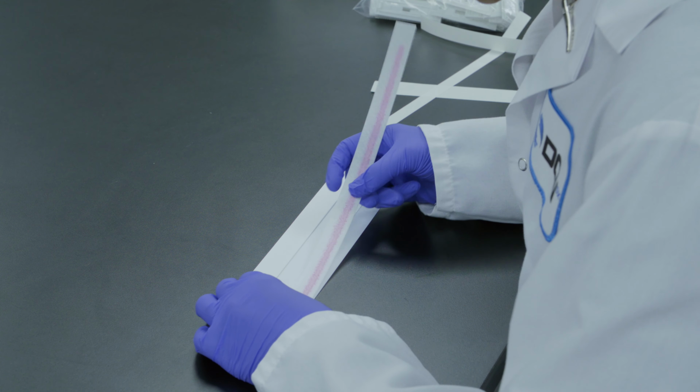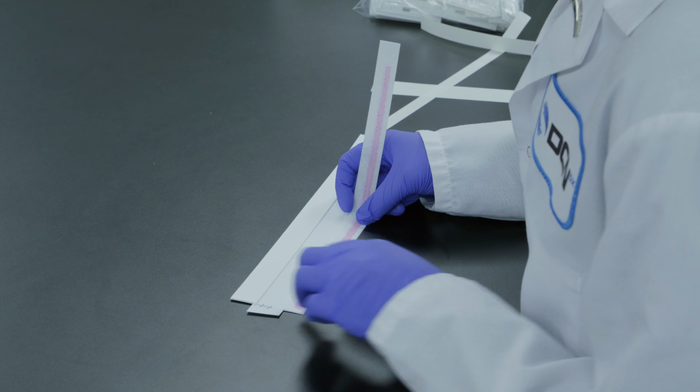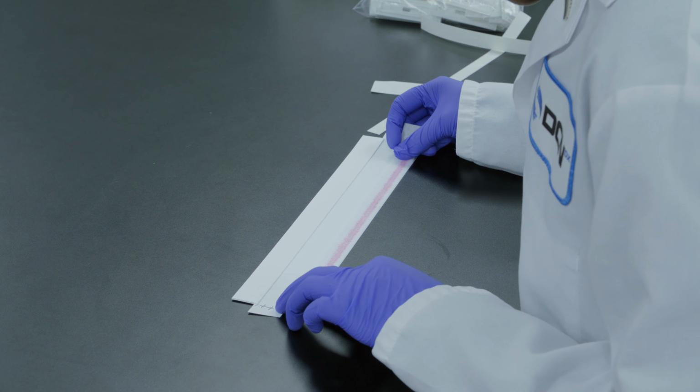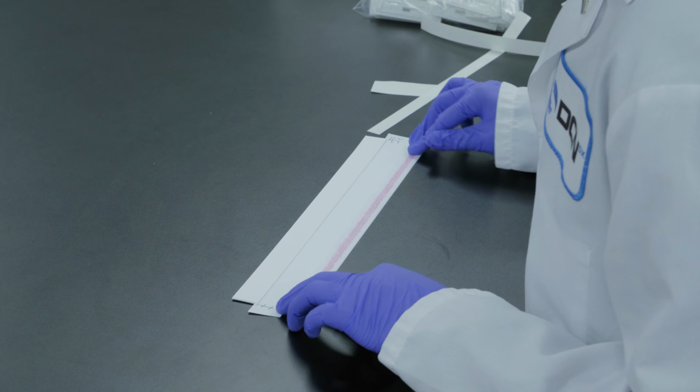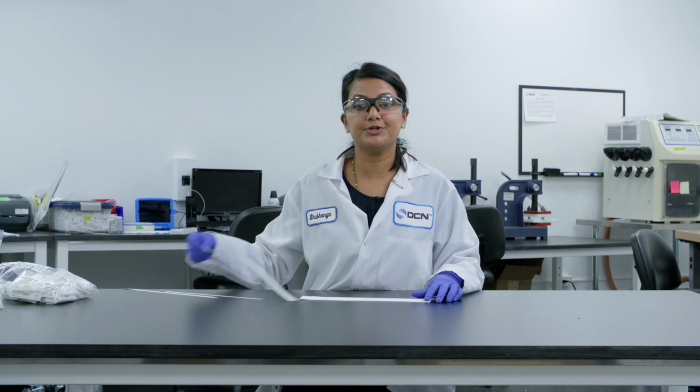And then just like we did for the wick, we are making sure that there is some contact from the conjugate pad to the membrane. And then press it in place. And then now I have an assembled card ready to cut into strips.